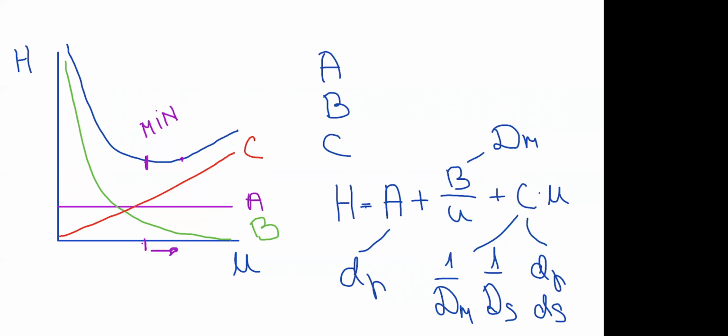But definitely we want to be somewhere here in this plateau region where the theoretical plate height is minimal. You definitely don't want to work somewhere where the plate height is very high. So these are not optimal for the analysis.